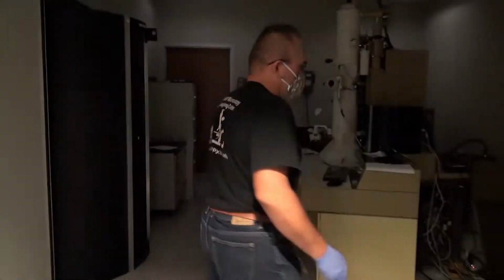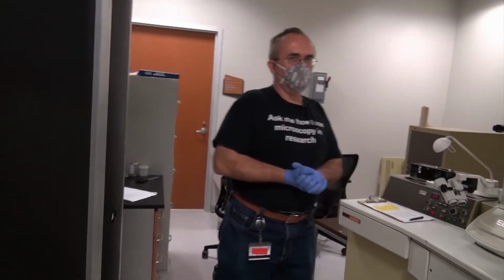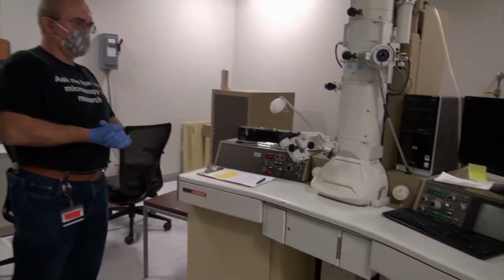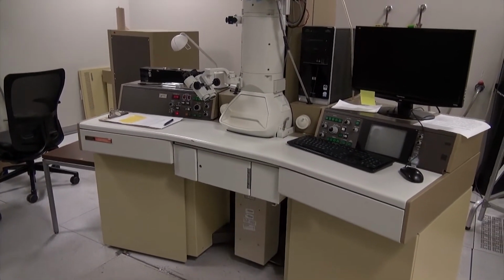Our third transmission electron microscope is a JEOL 1200X. It's a 100 kV microscope.